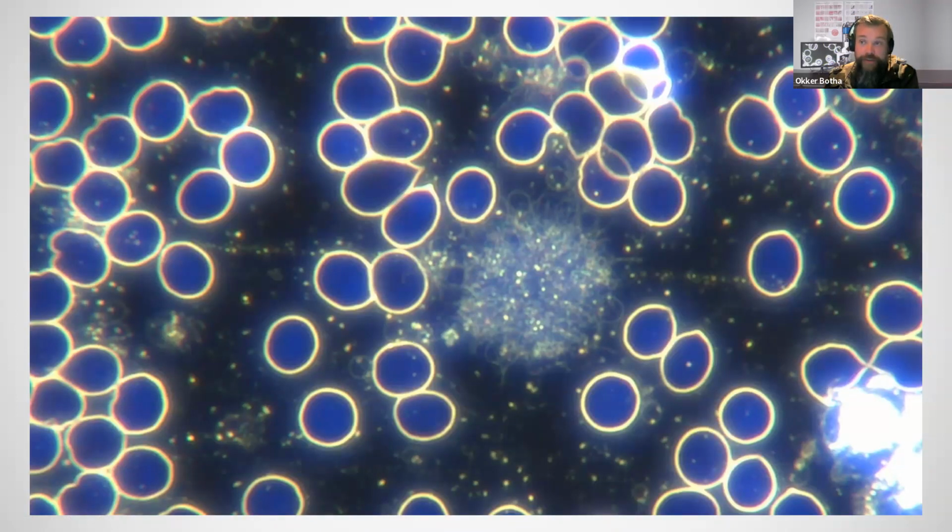So being able to identify this is really very valuable, and we're able to monitor this and obviously track progress during treatment. So again, these are the faint little bubble shaped structures in the background, also related to fermentation, also very important to be able to see.